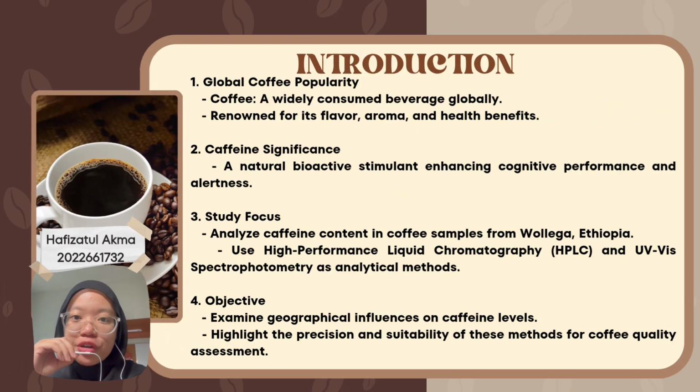For the introduction, coffee, one of the most consumed beverages globally, owes its popularity to its unique flavor, aroma, and health benefits. Among its numerous bioactive compounds, caffeine stands out as a natural stimulant influencing cognitive performance and alertness. This study investigated the caffeine content in coffee samples from Wollega, Ethiopia using two prominent analytical methods. First, HPLC, and second, UV-visible spectrometry.